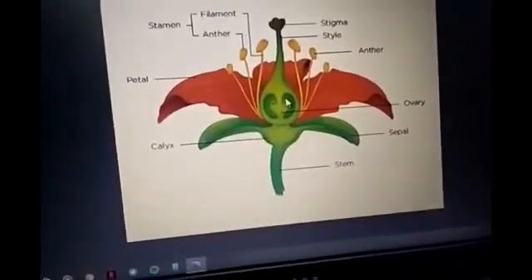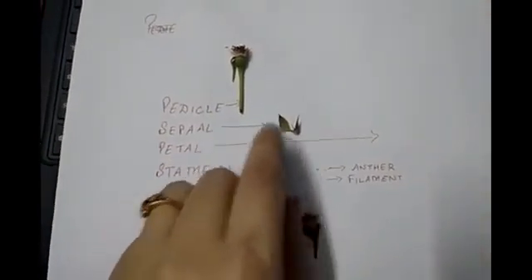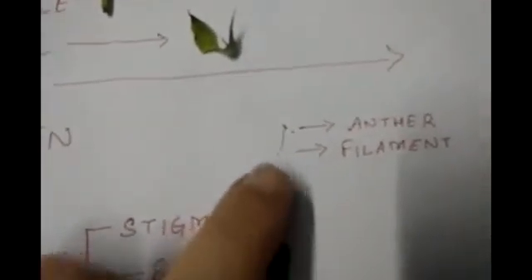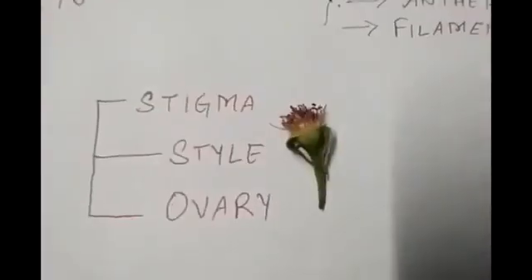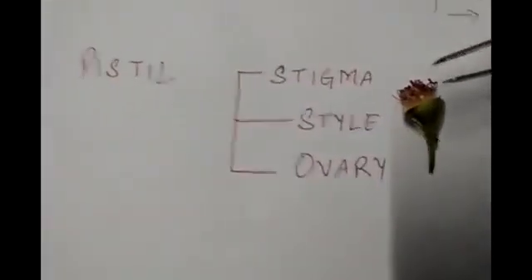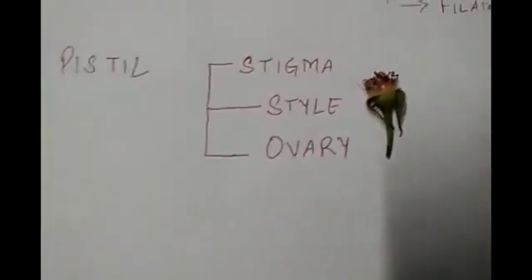Now I'll show you the fresh flower which I have dissected. You can see the stalk is the pedicel, and here are the sepals, which are green in color. Let's have a close look at the stamens — the swollen part is the anther and the stalk-like structure is the filament. Next, here is the female part of the flower — these pinkish-reddish colored structures are the pistil. The pistil has three parts: the smaller part is the stigma, the cylindrical part is the style, and the swollen part is the ovary where true fertilization occurs.